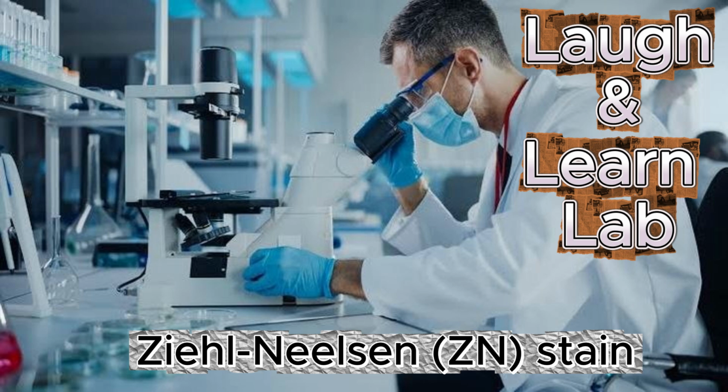When stained correctly, acid-fast bacteria appear bright red. The surrounding cells and background appear blue. The Ziehl-Neelsen method uses 3 important reagents.